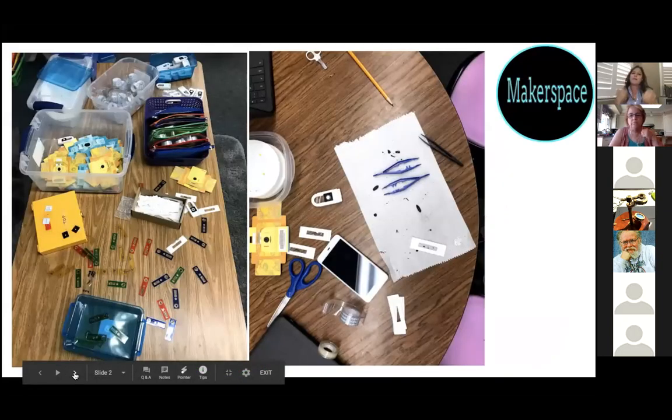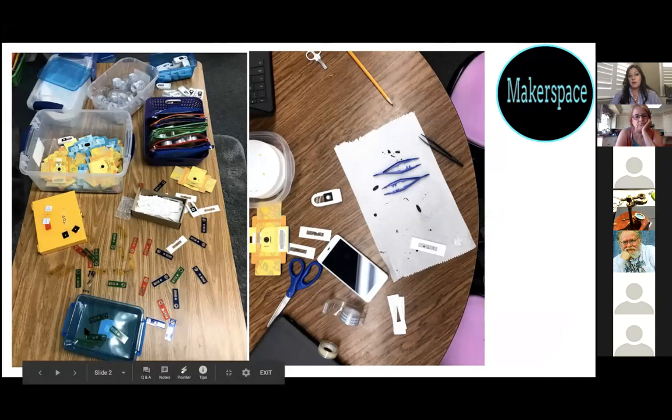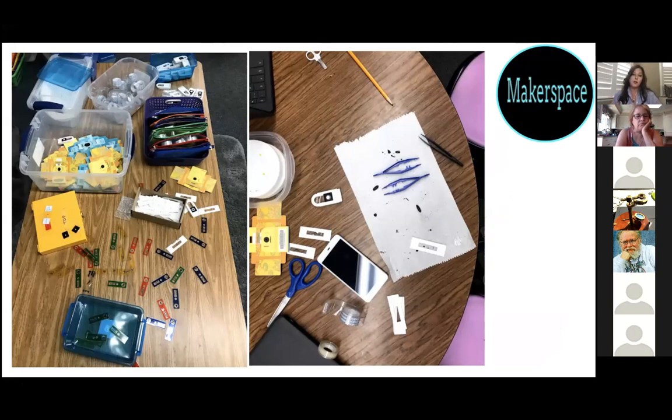First off, if you have a makerspace in your classroom or a makerspace room at your school, using Foldscopes is a really easy way to integrate microscopy into your classroom and introduce it to kids. You can start with prepared slides, then help them learn to focus, and then work your way into having them make their own slides.